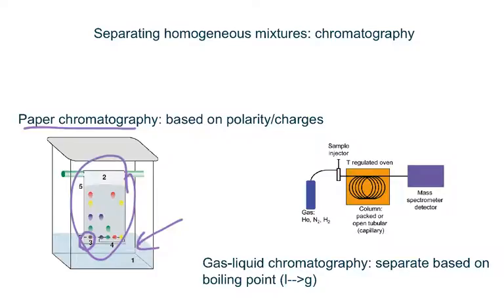And what will happen is that this liquid mixture in that dot labeled 3 will slowly travel up the paper along with the water, of course, and it will separate into different colors because, as I said, some chemicals have more charges than other chemicals, which is this idea of polarity, which we won't get into, but basically they're separated using water and based on polarity, aka charges.